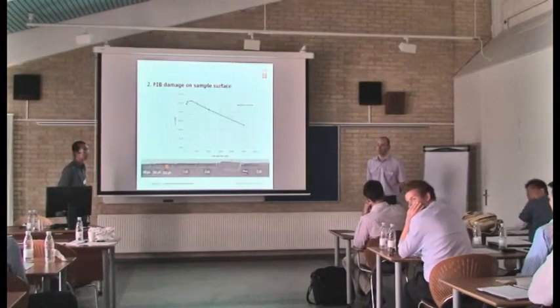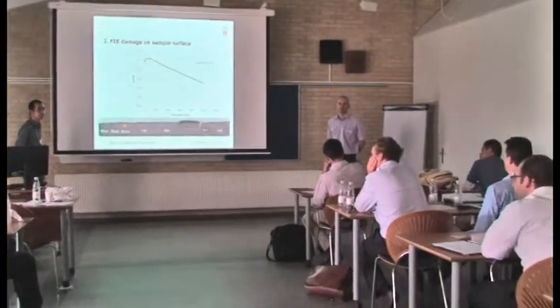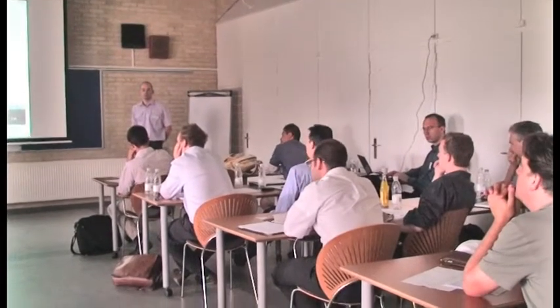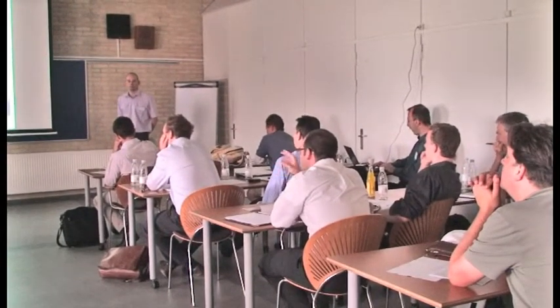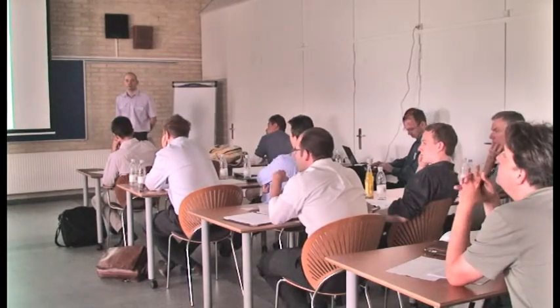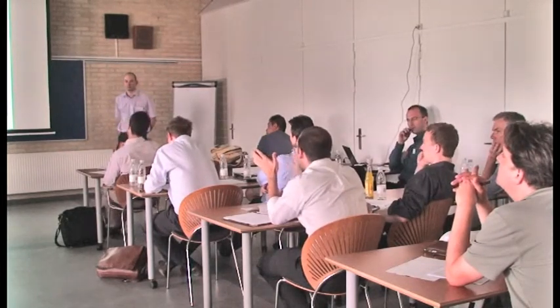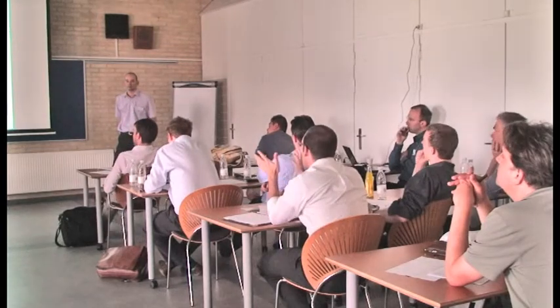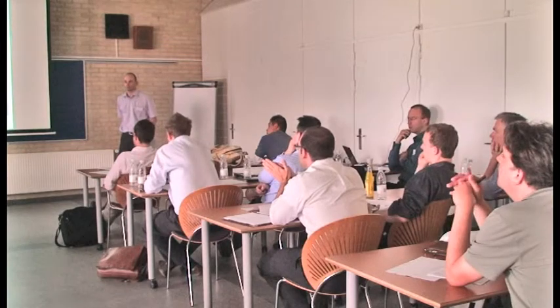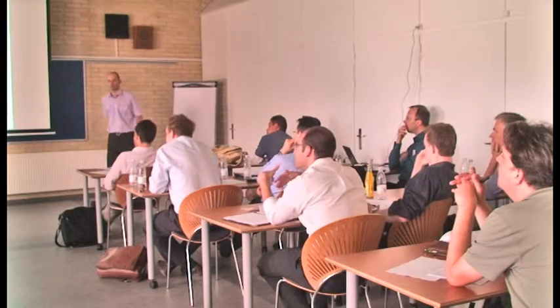Yes. Now, my understanding of EBSD sample prep with an ion beam is that your depth of damage is going to be a function of the beam energy, and obviously also a function of the current. But is it conceivable to go to lower energy to reduce the damage, or is that too much of a trade-off in the time to mill?